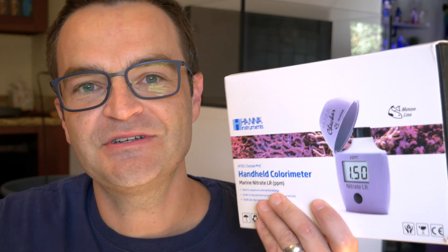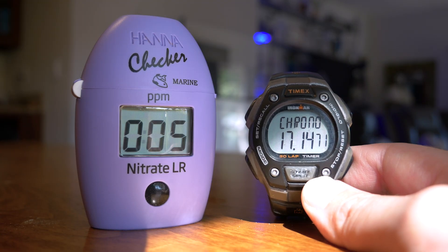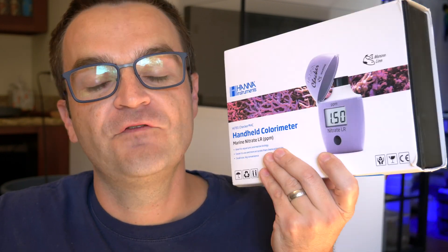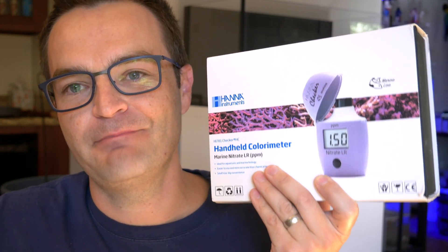Who does not need this checker? Most hobbyists. I'm just not going to spend 17 and a half minutes — maybe I could lower it to around 15 — every single weekend, just to get an accurate nitrate reading. I would rather spend five minutes using one of those other test kits and get a rough approximation that is adequate for my needs. I'm not saying this is a bad checker. It's just way too complicated for most hobbyists and unnecessary, especially given the amount of time it takes.